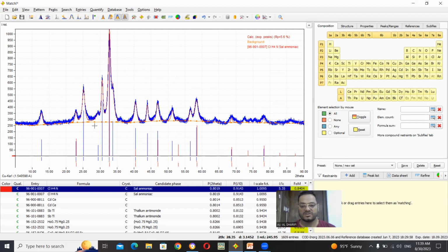This line shows me the first line, not the input. I have input, output, and this first line. This first line shows me the impurity diffraction using X-ray diffraction to analyze my data.